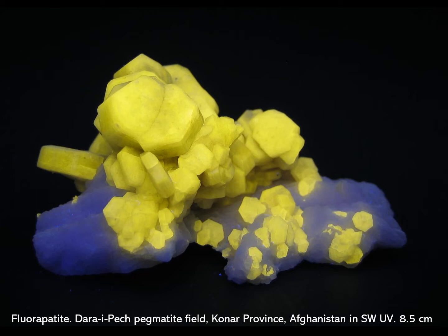This piece in particular, from the Dera-Ipesh pegmatite field in Afghanistan, fluoresces really homogenously yellow in shortwave. As you'll see later on, that's not always the case with apatite, that it will fluoresce one color.